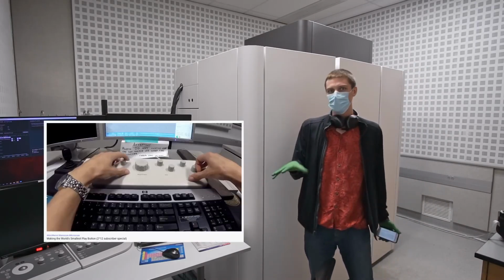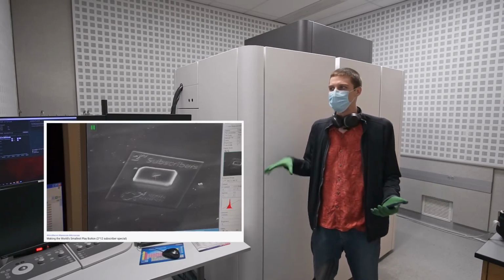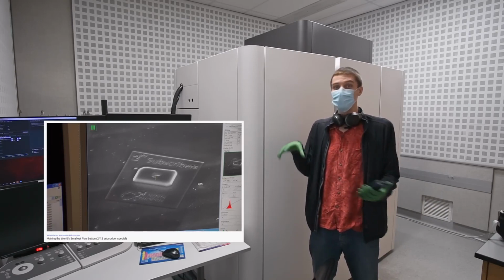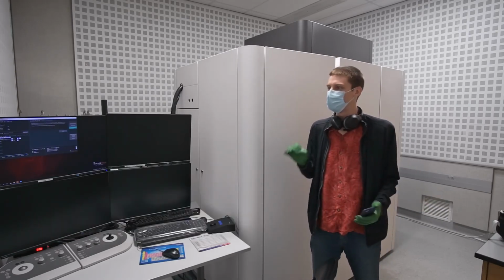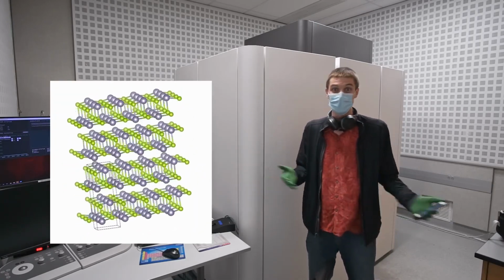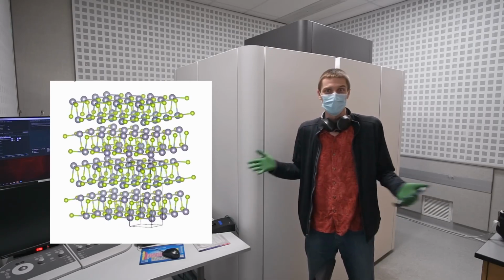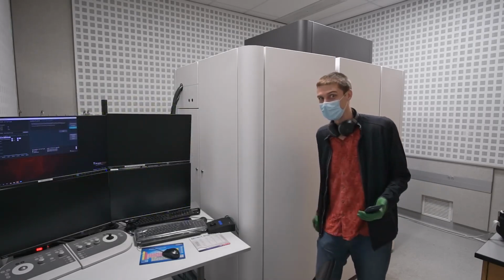So my last microscopy video was making a play button, which was kind of a joke. But today I'm going to be doing some real research. I'm going to be looking for a specific defect in a crystalline material called tin selenide. And I'm not sure that I'm going to be able to find it, but either way, I'll learn something. So this is going to be like real research happening right before your eyes on YouTube today.